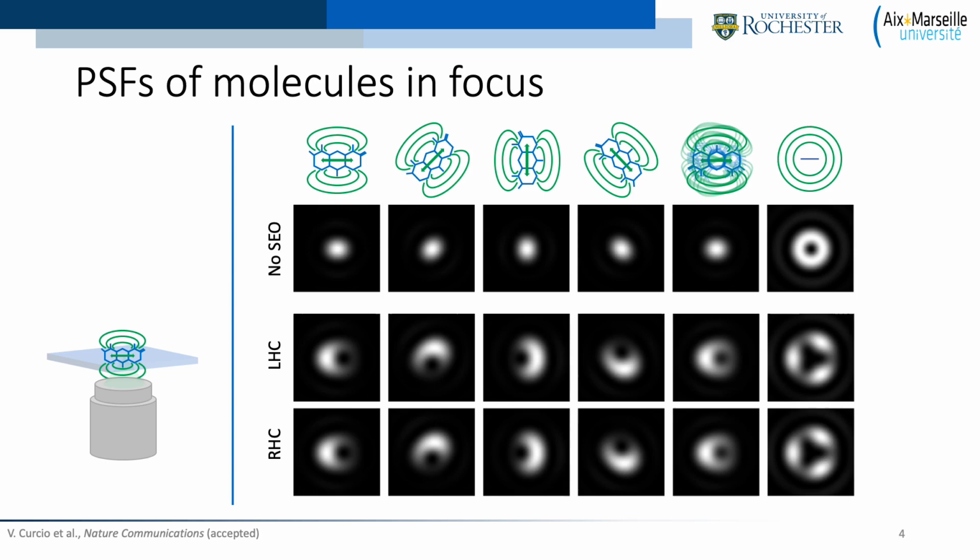Now, when you have a longitudinal molecule, we get this PSF with trigonal symmetry, and when the molecule is wobbling, as in the fifth column, the PSF only gets blurred. The important thing is that it gets blurred in a known way, so we can retrieve the information of the movement.